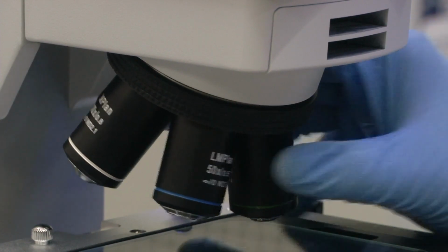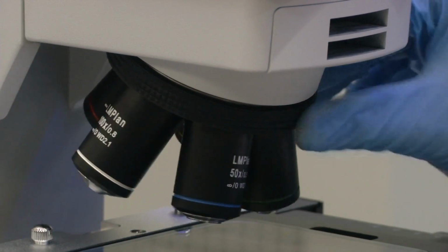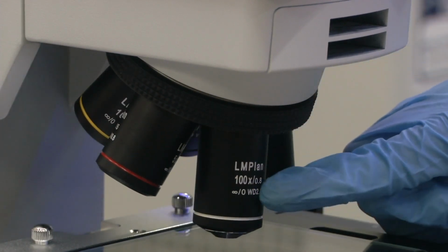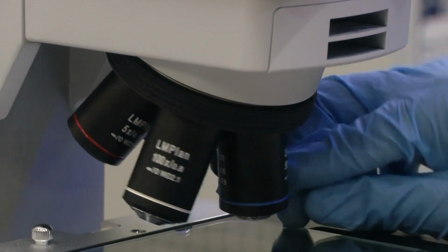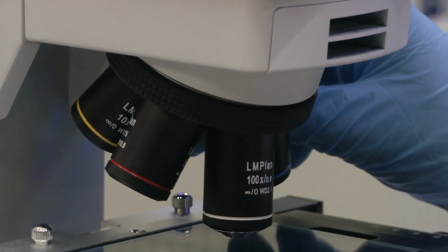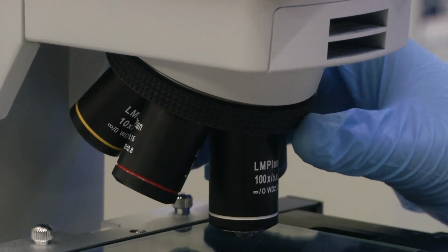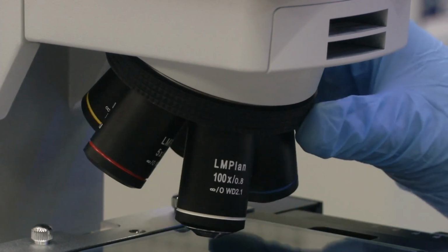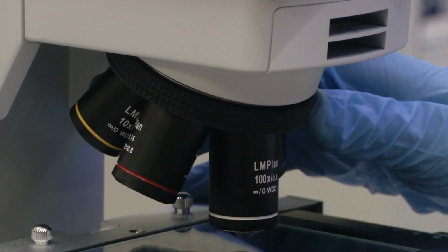Then we have two more, which is 50x here, the blue one, and 100x, which is 0.8. If you see, the working distance for each of these lenses is coming down as you go up. This is because with 100x magnification, you have to be very close to your sample to use that lens. So, the working distance will automatically come down. That is why here WD is 2.1 and the magnification provided is 100x.